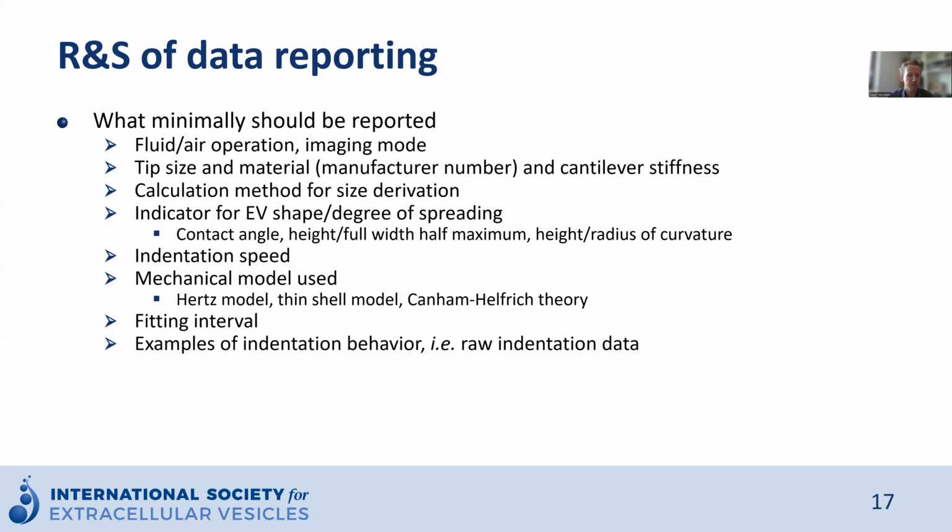radius of curvature. For mechanical measurements, in addition, it would be recommended to indicate the indentation speed, because this can affect the mechanical measurements. Also report the mechanical model that you use to derive the elastic moduli, for example, the Hertz model, the thin shell model, or the Canham-Helfrich theory.